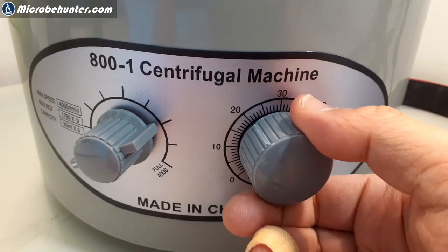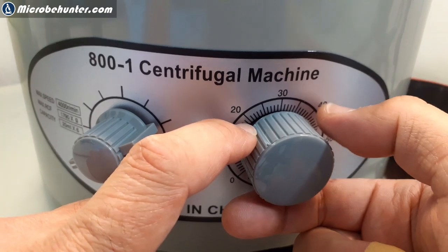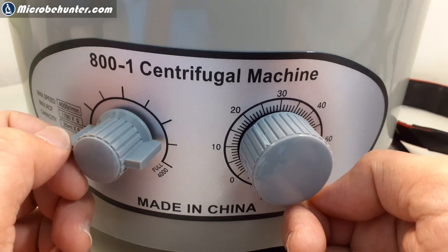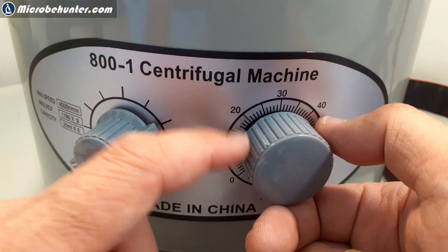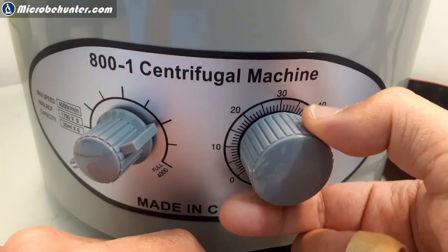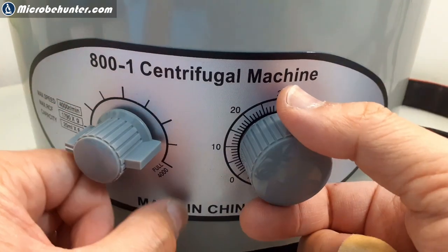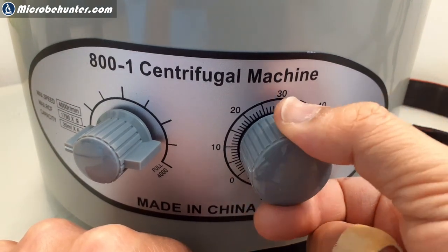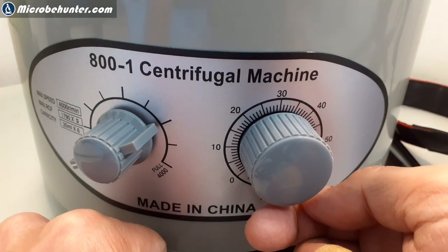So now it's set for 20 minutes — you can see it here on the dial. It's going to run down until zero. When I switch it on, it's going to start running. If I want to reset this to zero, all I have to do is turn it back, and then it will also switch off and not work anymore. If I want to start it again, just turn it up again. I can switch it off here, or I can switch it off here as well.